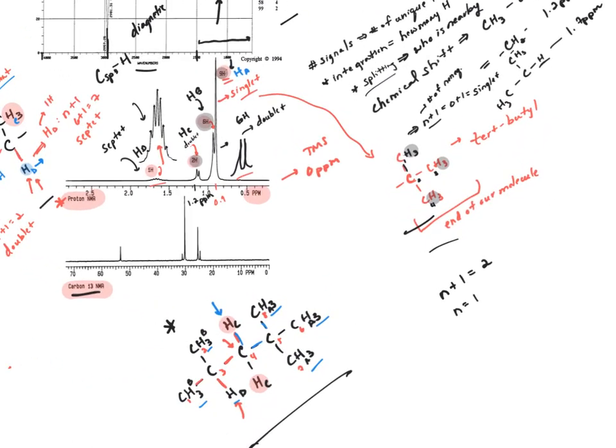But really for mass spec, the only thing I've talked about is how to take this data and determine the molecular formula. The molecular formula is already being given to you, so you don't need to do that, right? There is some stuff, if you want to go through the book, where certain types of fragments give certain characteristic signals in the mass spec data. But again, I think most of that can come from the splitting pattern and the number of signals in the H1 NMR data, all right?